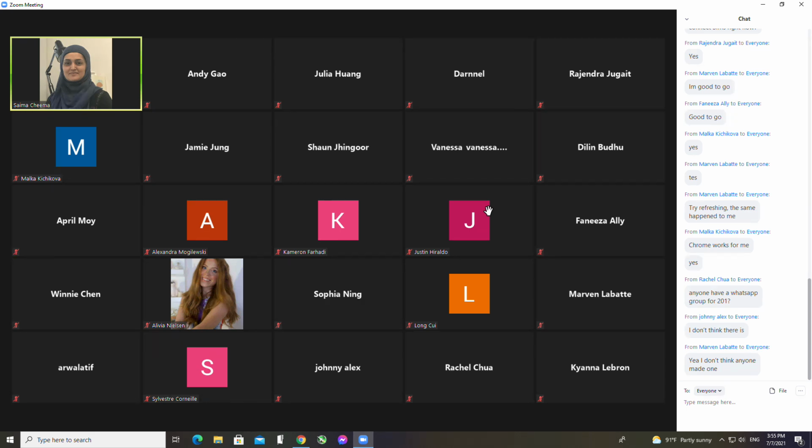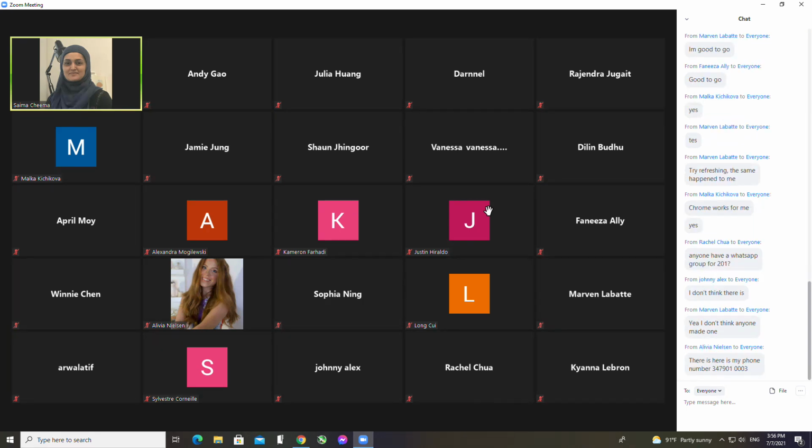If you took away the micrometer and instead put the specimen, you see red markings, and that's the ocular ruler. When you put in the micrometer, you start seeing black markings as well. That black ruler is the stage ruler, and you also know because it's the one that moves when you move the slide around using X and Y translation.